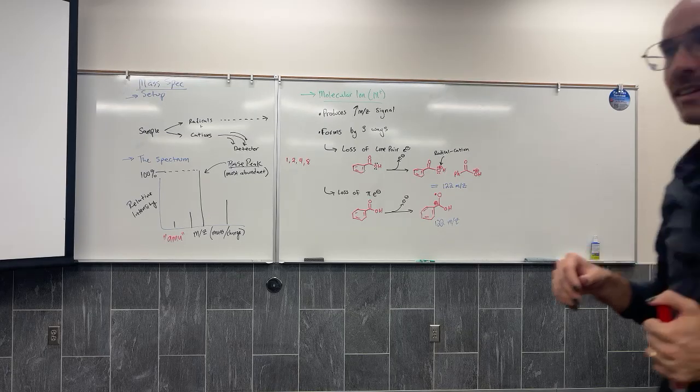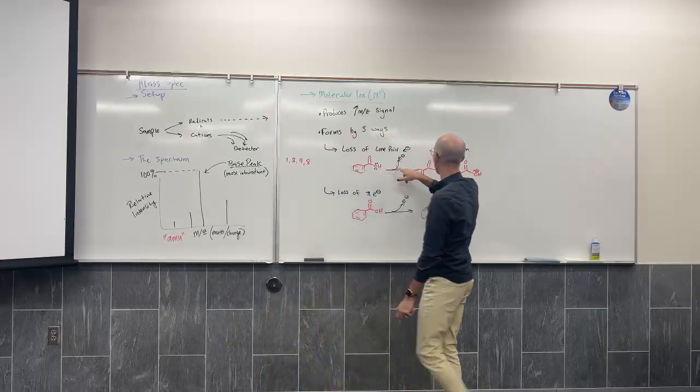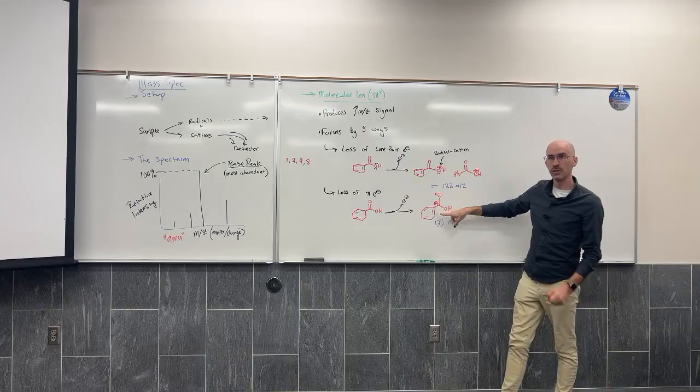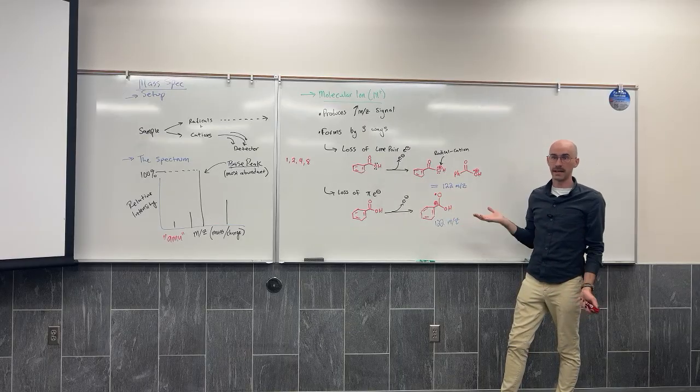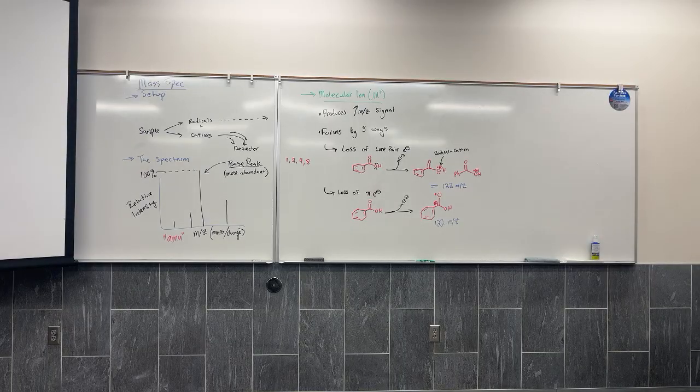Are we right or wrong? Wrong, but close. What's wrong? You have a CH2 in the ring, and there were no CH2s in the molecule. Mine might be wrong. Yours has no radical. That's not a radical. Molecular ion is a radical cation. Your structure had a cation. I didn't see a radical. There you go. That was it.